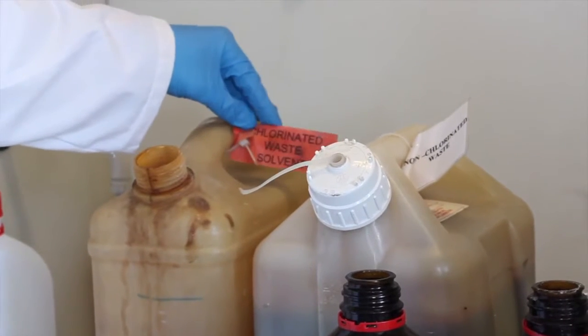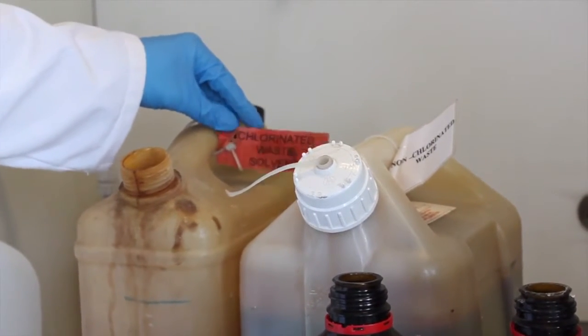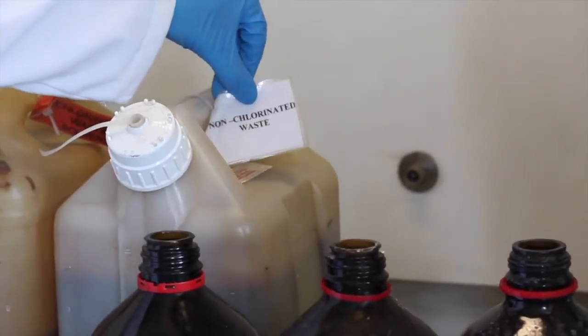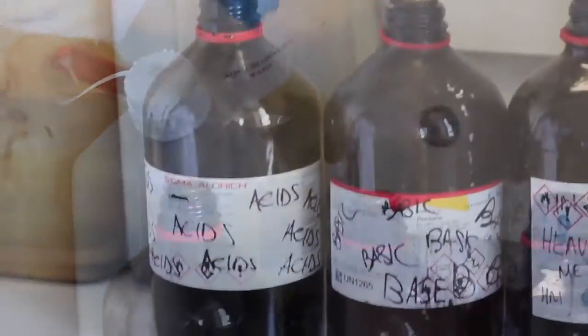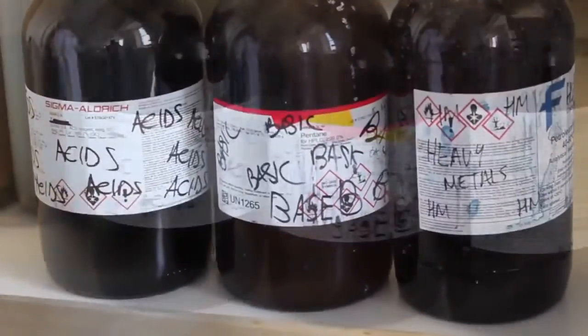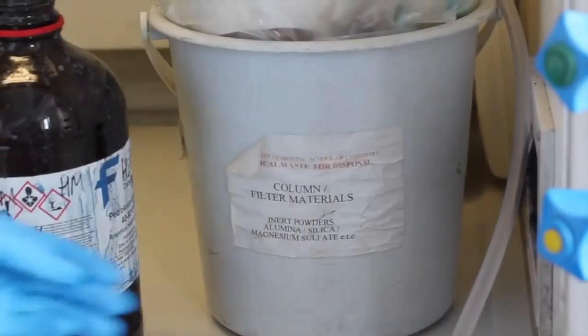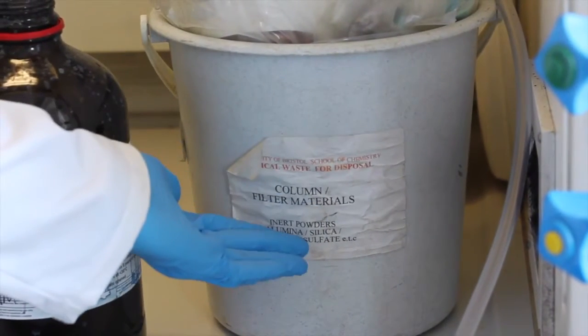Our waste fumehood contains 6 different containers from left to right. First, the chlorinated organic solvents. Second, non-chlorinated organic solvents. Third, acid wastes. Fourth, basic wastes. Fifth, heavy metal wastes. And sixth, solid wastes.